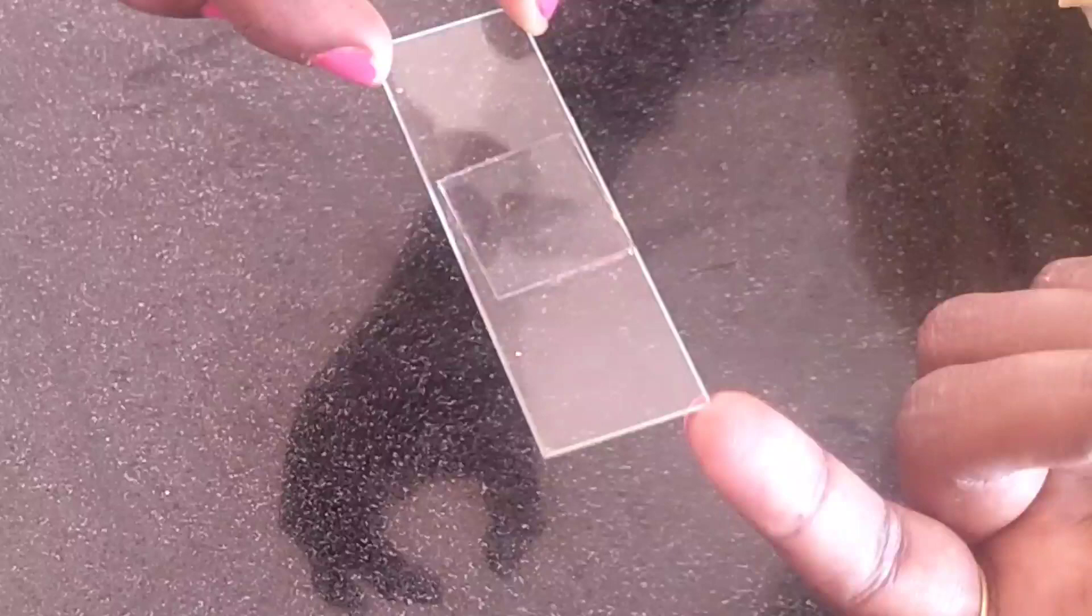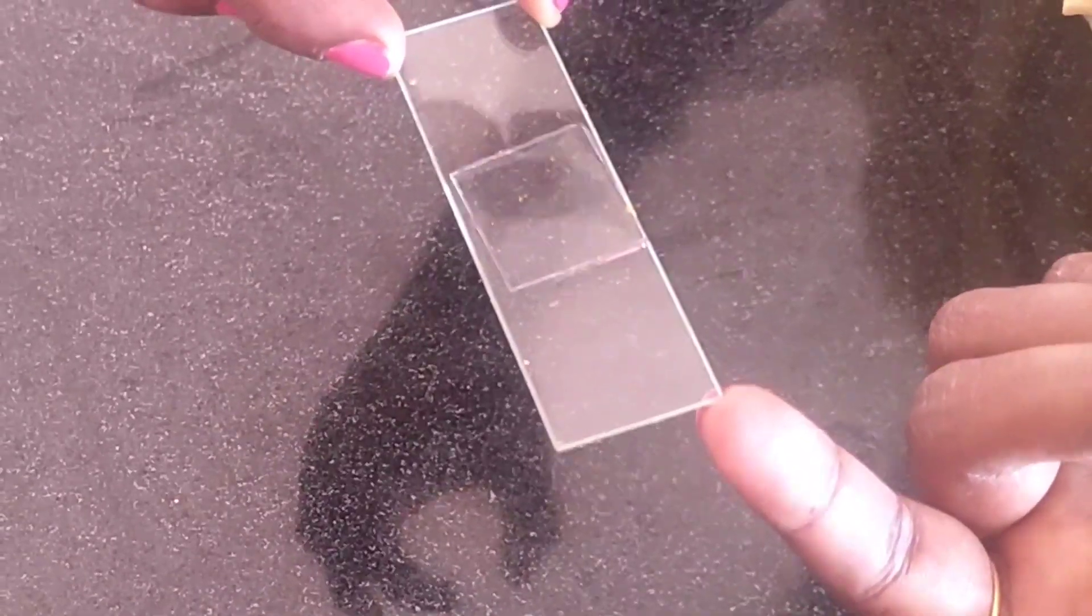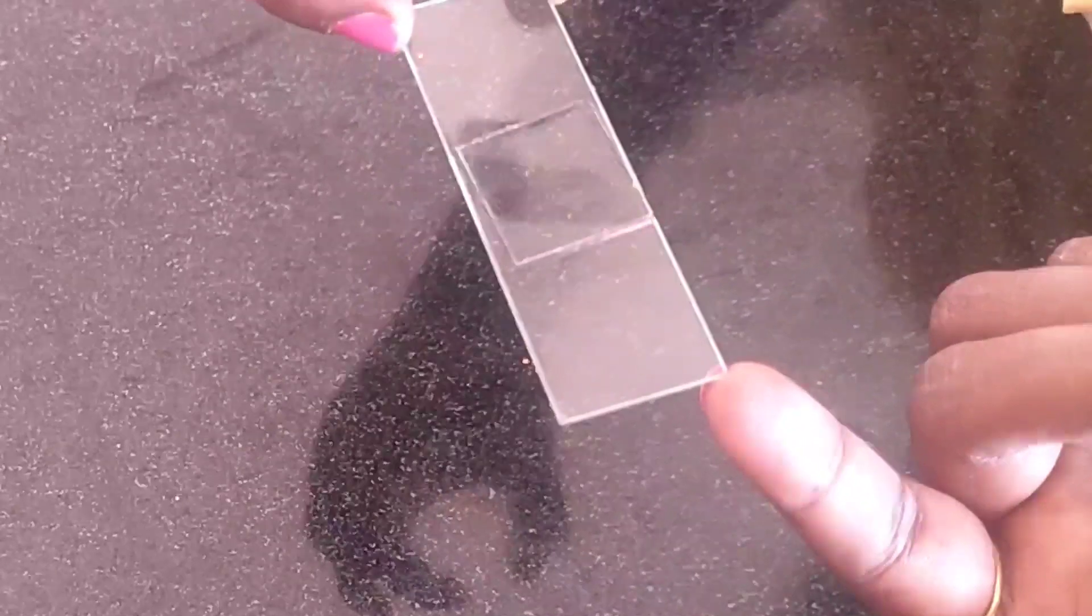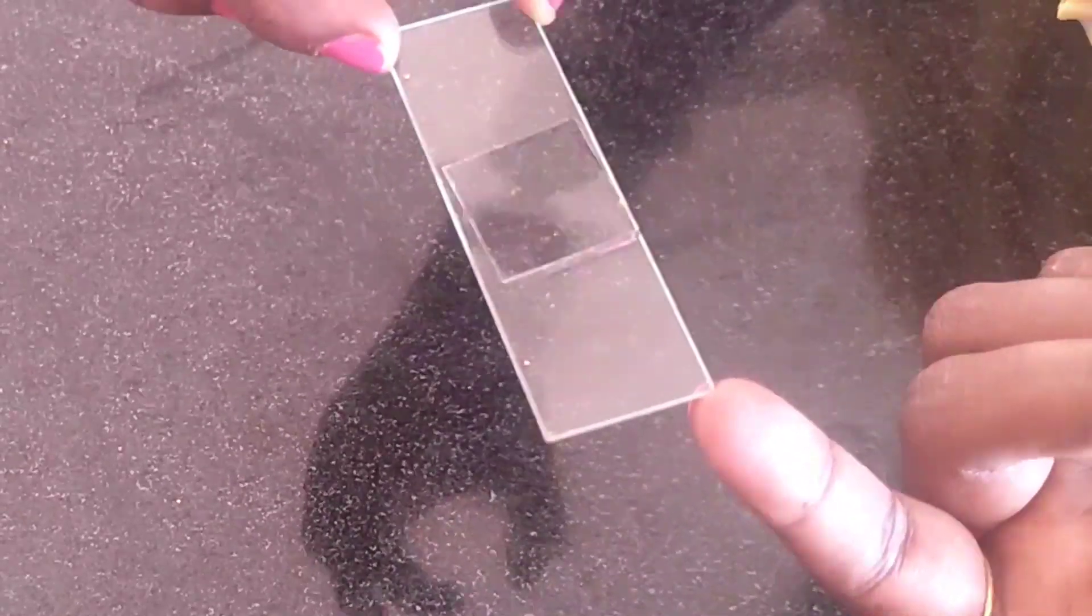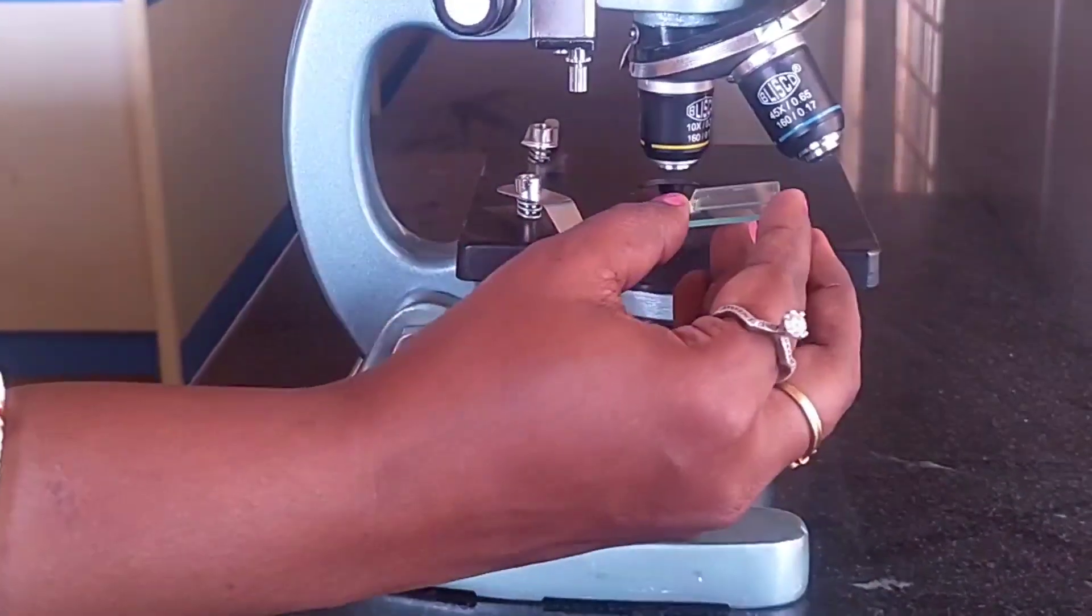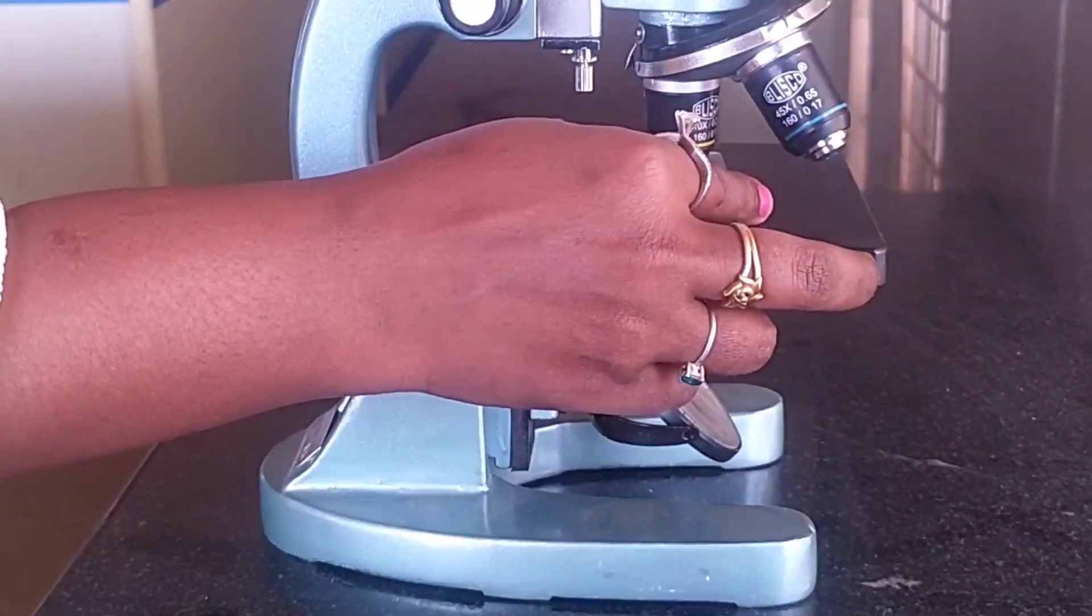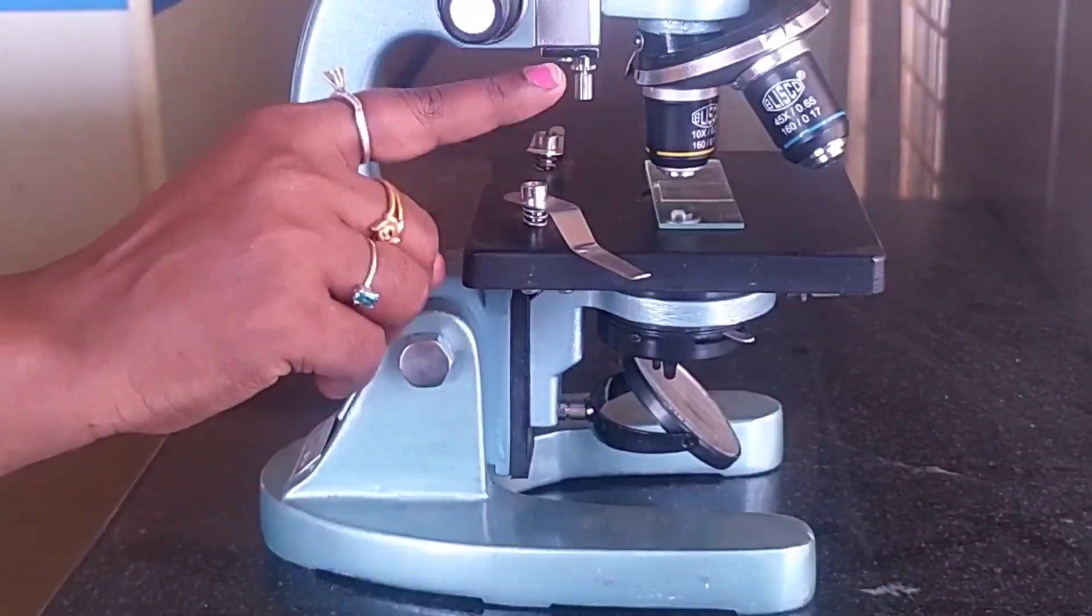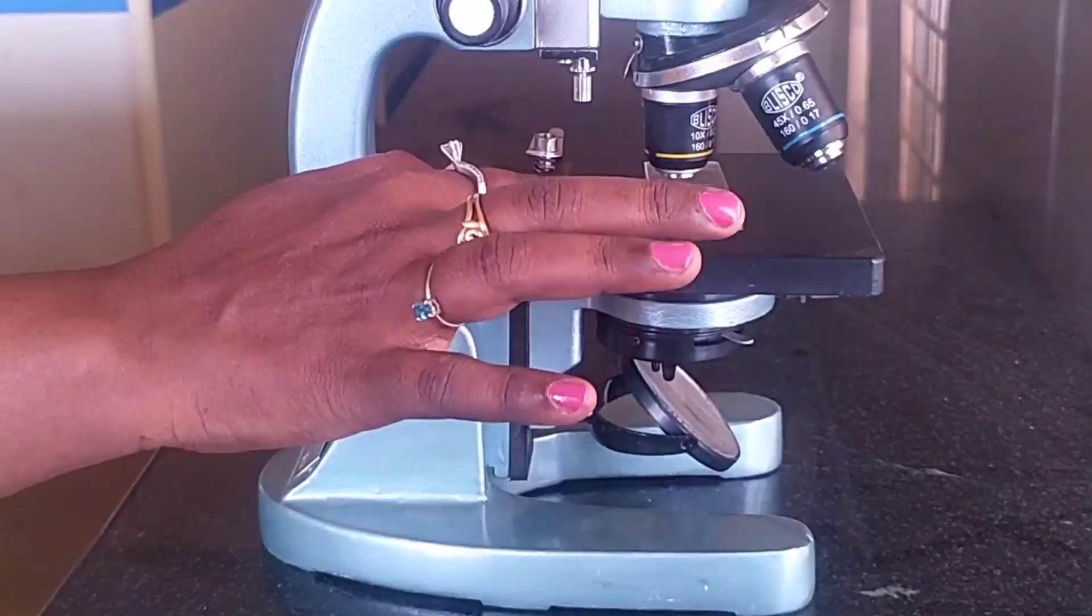Now we have to view this slide under the microscope and you have to count how many pollen grains are present initially. We need to keep this slide under the microscope and study the initial pollen grains, or number of pollen grains that is present on this slide.